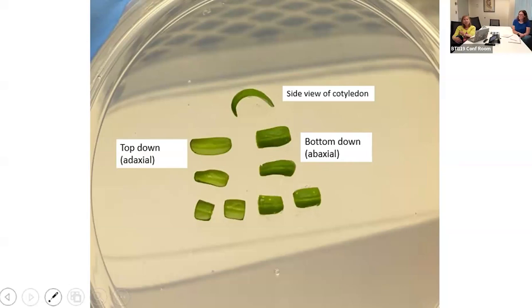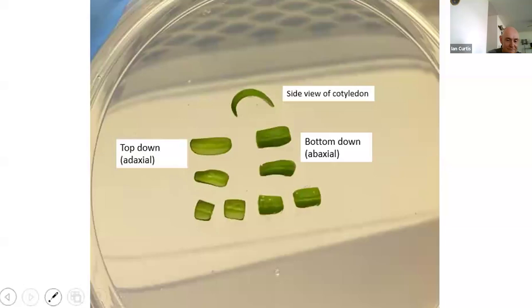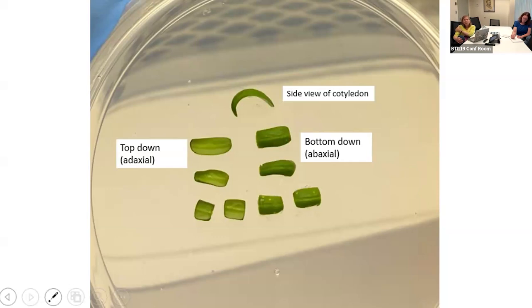As I mentioned, I already had this protocol in place before I joined BTI, and I don't know if they looked at that. But it's a good point, Ian, because sometimes that petiole is extremely regenerable, and you might even see the regeneration come from that petiole end. So again, we haven't, and I don't know if the people who put this in place ever did. But that's a good point.